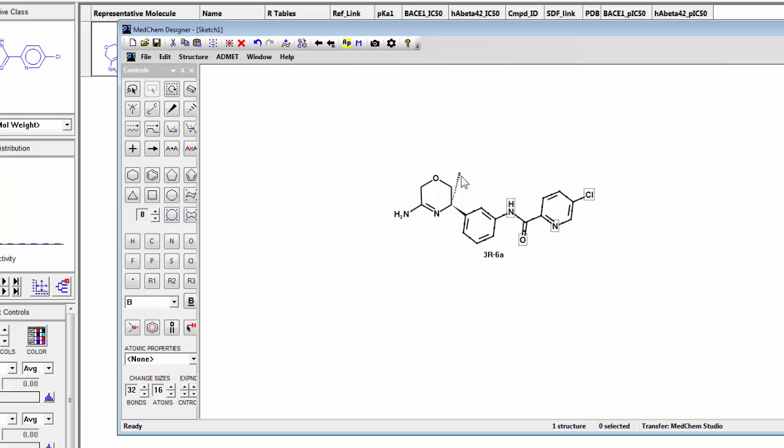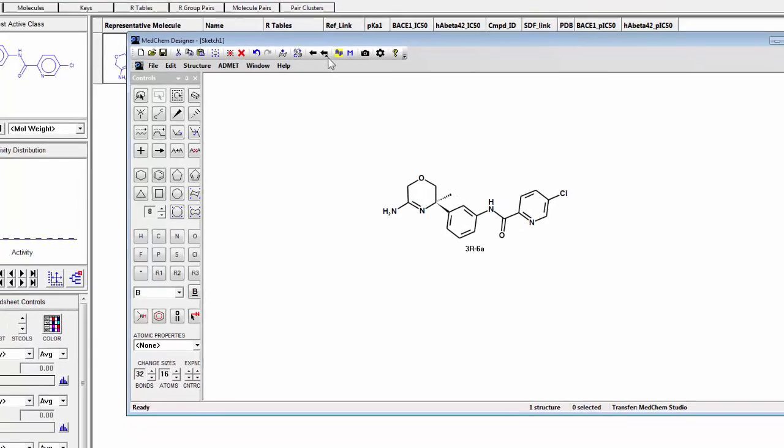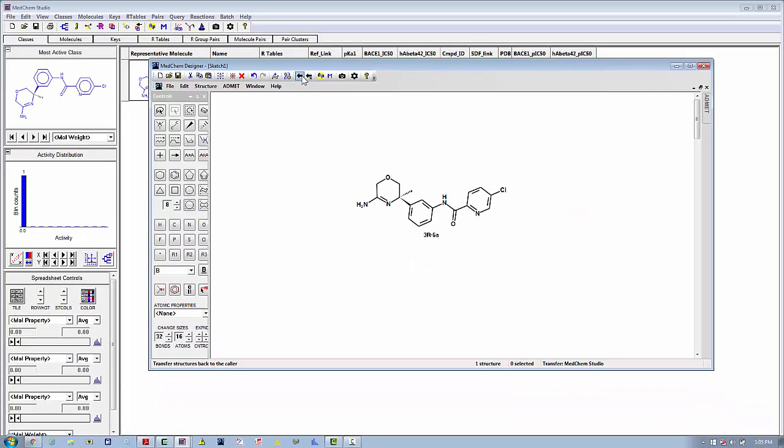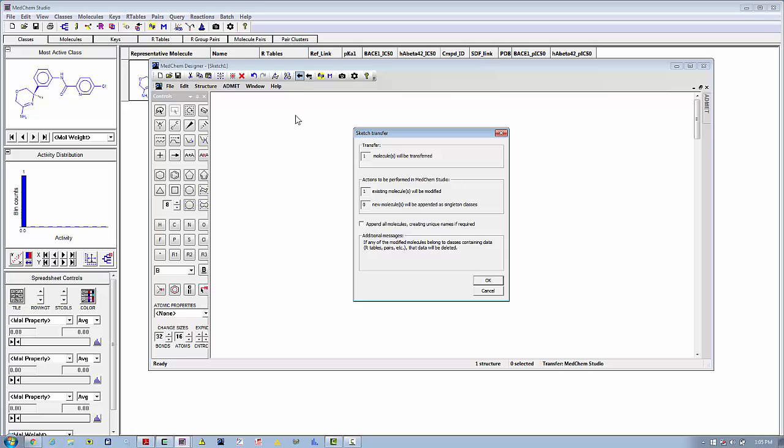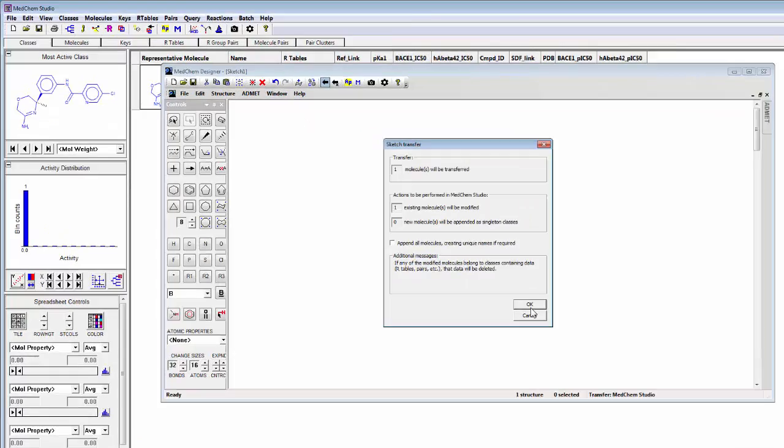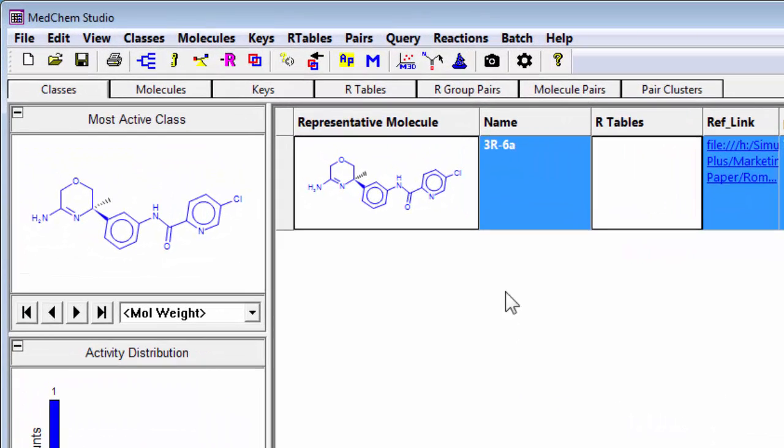Now I want to just fix the geometry or make that methyl group in a better position. And so now this is the structure I want to work with and then I just take this back over into MedChem Studio.